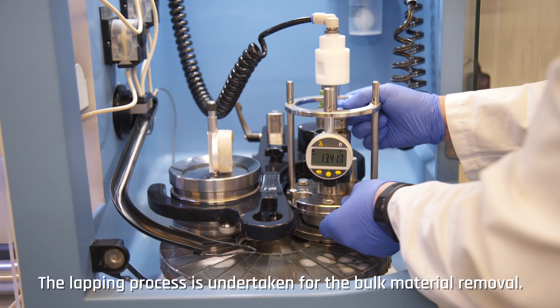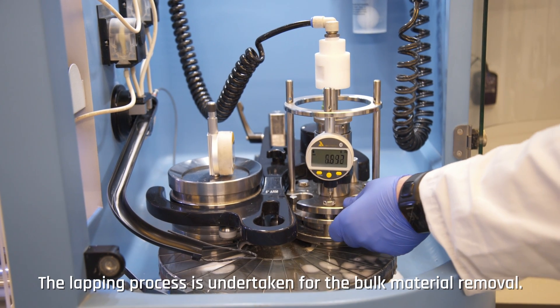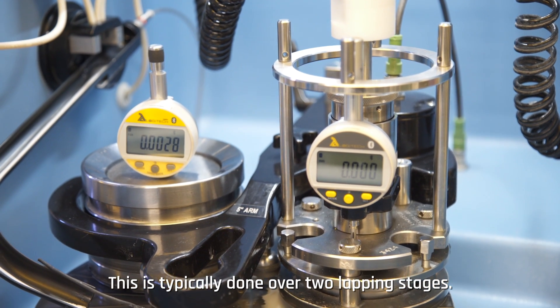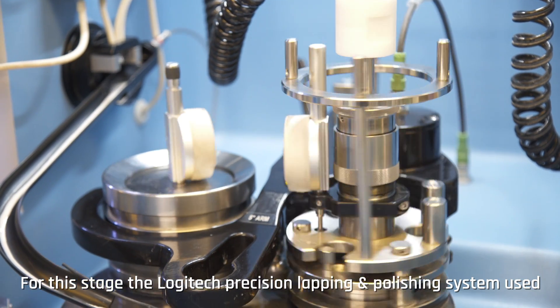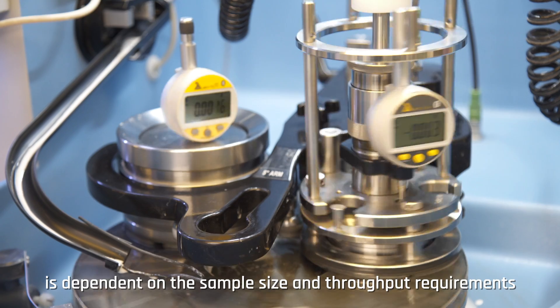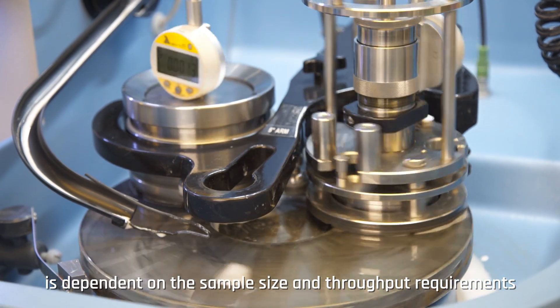The lapping process is undertaken for the bulk material removal. This is typically done over two lapping stages. For this stage, the Logitech precision lapping and polishing system used is dependent on sample size and throughput requirements for the customer specific requirements.